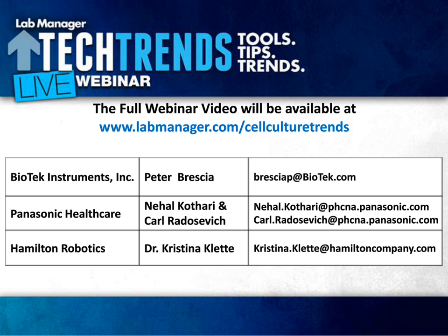Great, thank you. Any other additions to that question for Kristina or Carl? No? Then I guess we'll move on. If you're considering automating or you're setting up a new cell culture lab, how important is the layout and the equipment placement? Do you need to consider traffic and airflow and that sort of thing in your lab?